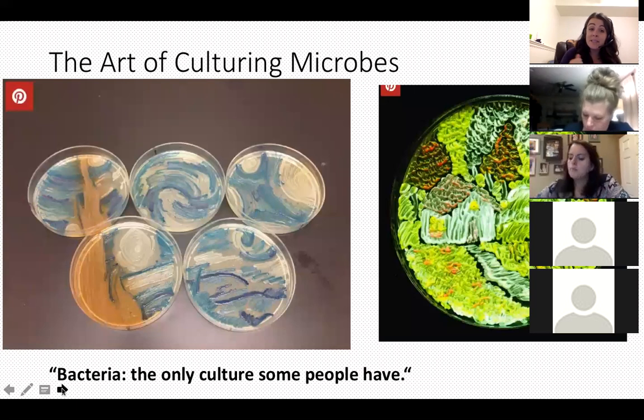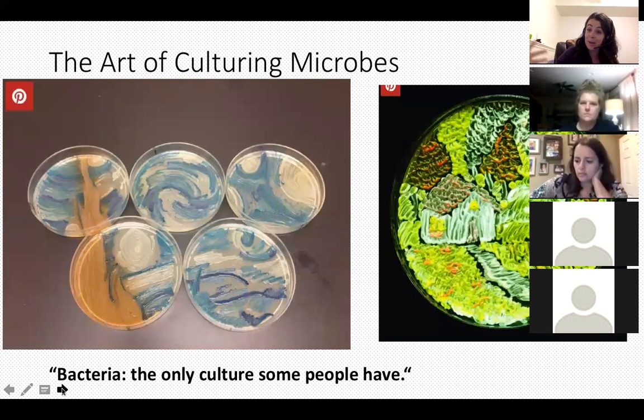So today we get to talk about culturing microbes. There was a journal that had this nerdy, sciencey competition that asked people to make art with culturing microbes. And these are some of the things that they got.